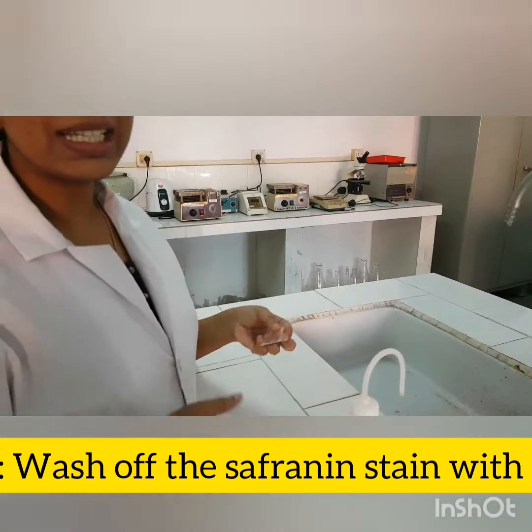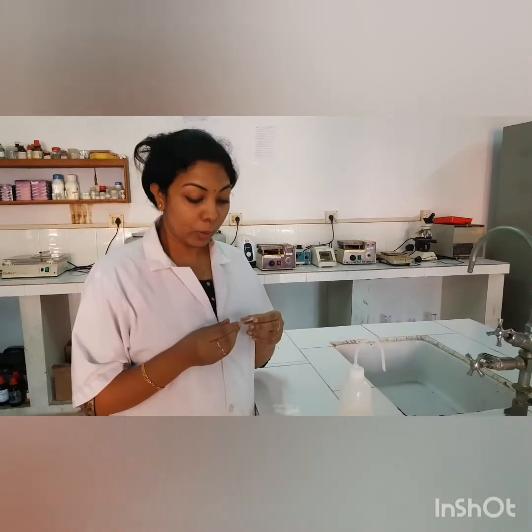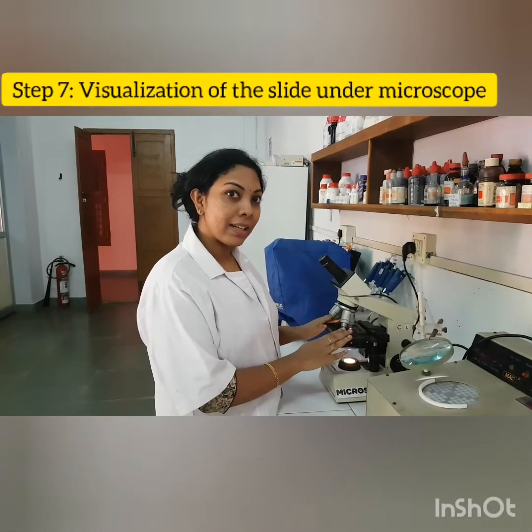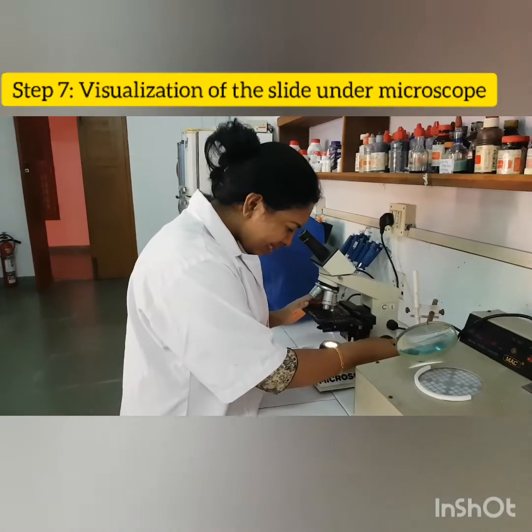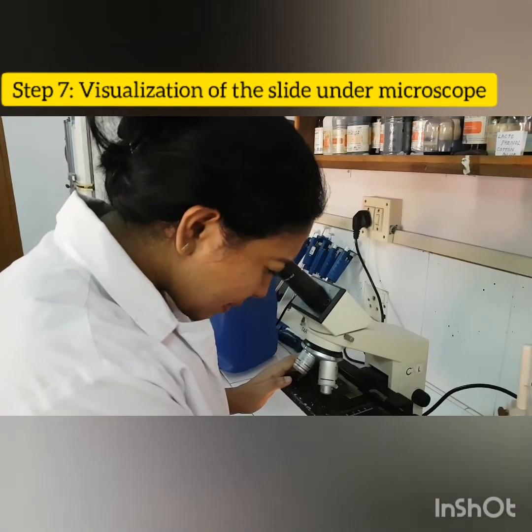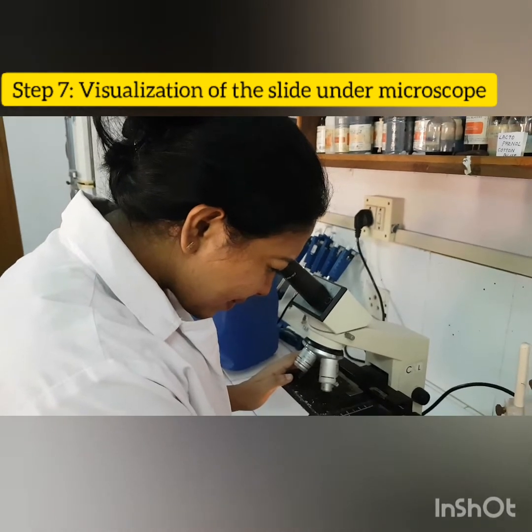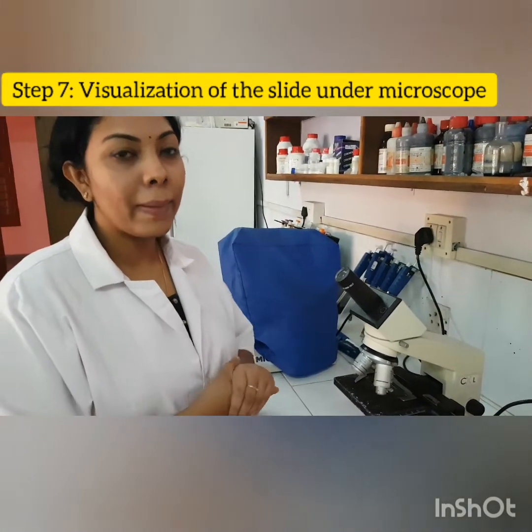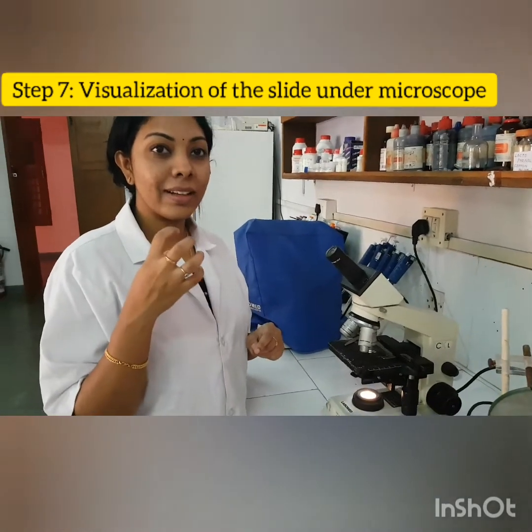Now you can view it under the microscope. I already told you the vegetative cells appear pink, or a kind of dark brownish pink color, and the endospores appear bright green. Now we will try to focus the slide under the microscope. A mixture of endospores and bacterial cells, that is mostly safranin stain.